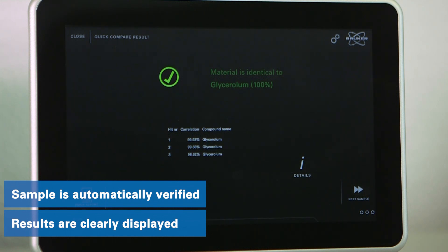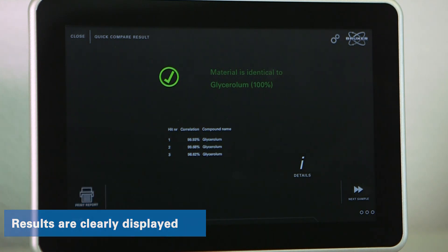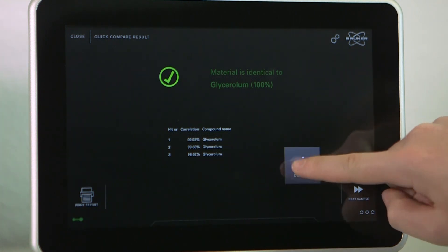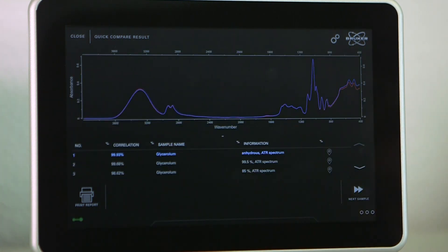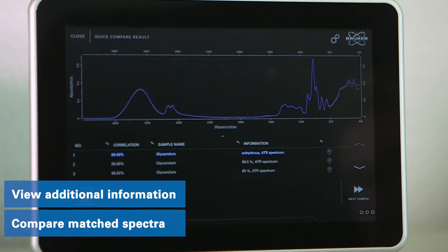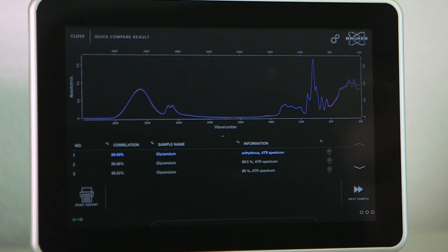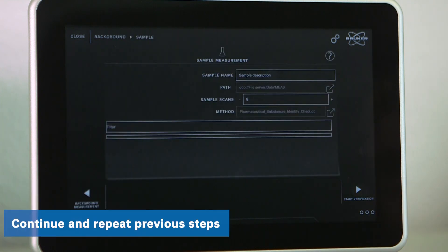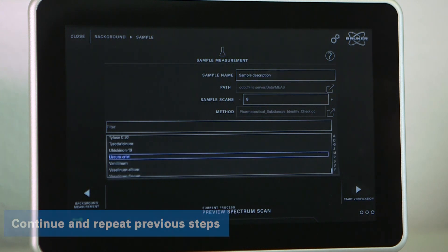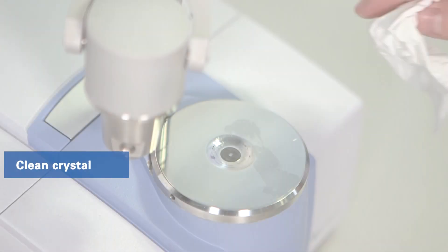In this example, we successfully verified the liquid as glycerol. After the analysis, you can take a closer look at the measured and reference spectrum, print a report, or just continue to verify your next sample by repeating the previous steps.